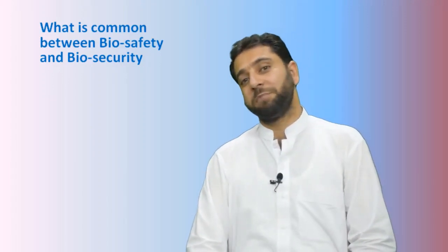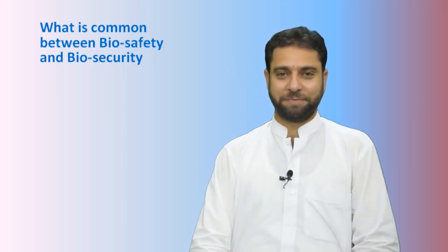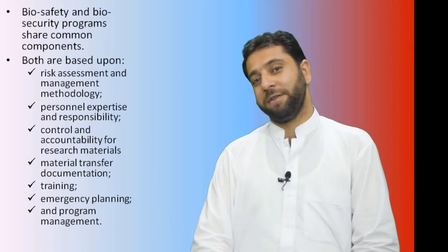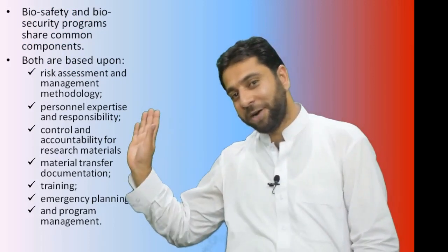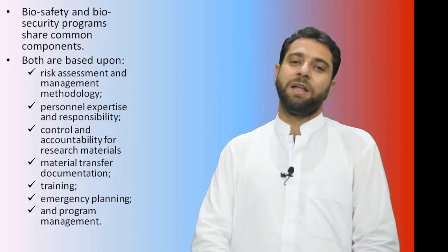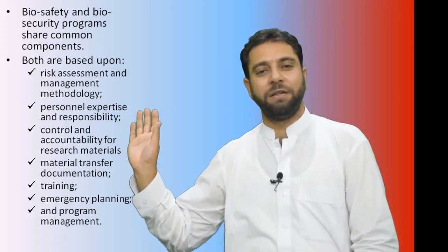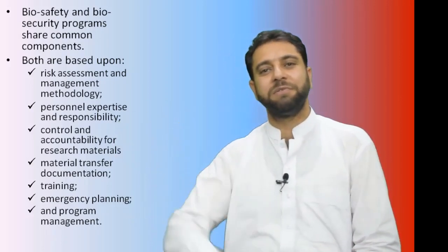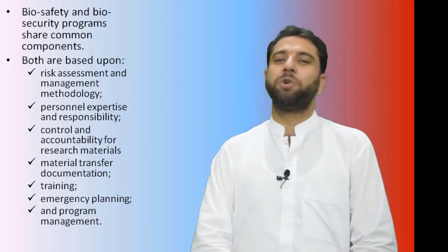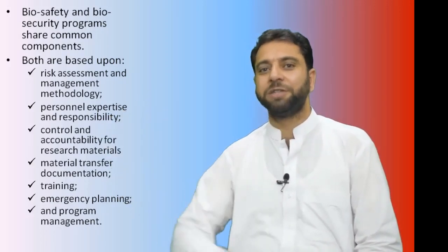The common components in biosafety and biosecurity programs are: both are based upon risk assessment and management methodology. Both are based upon the personnel expertise and responsibilities. Both the programs have control and accountability for research materials.